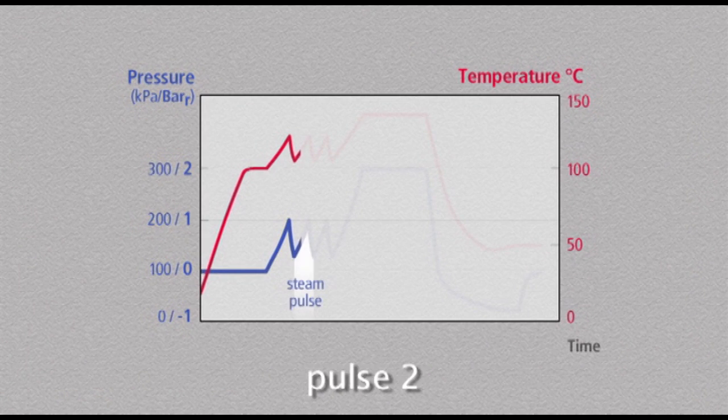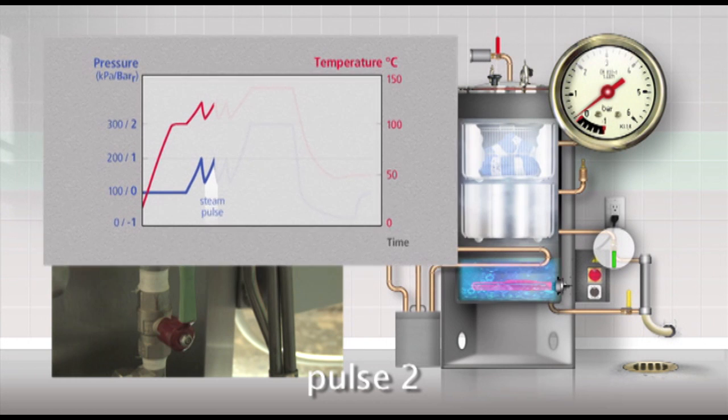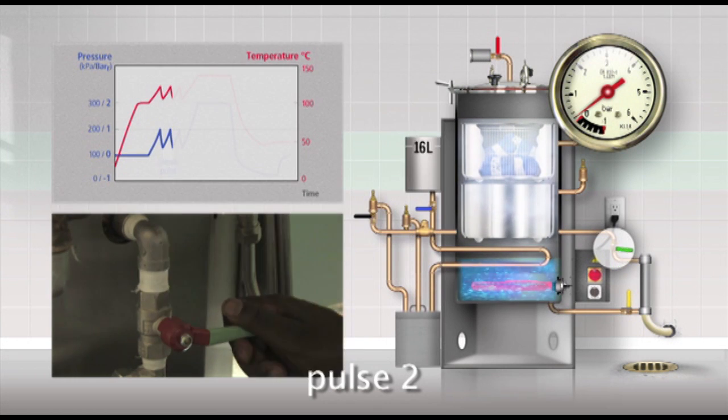Allow the pressure to build up a second time to 1 bar. Then open the green pressure release valve again. Let the pressure drop to 0.2 bar and then again close the green pressure release valve.